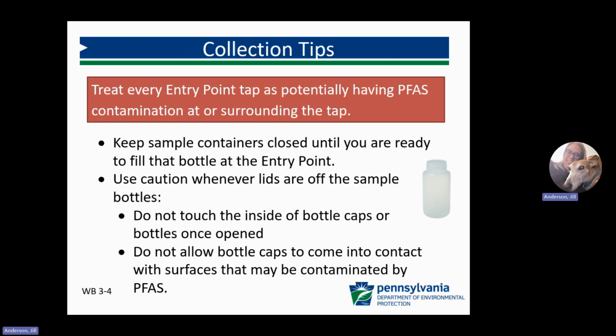Remove aerators, screens, washers, hoses, and water filters, if present, from the tap prior to flushing. Samplers should treat every entry point tap as potentially having PFAS contamination at or surrounding the tap. Keep sample containers closed until you are ready to fill the bottle at the entry point.